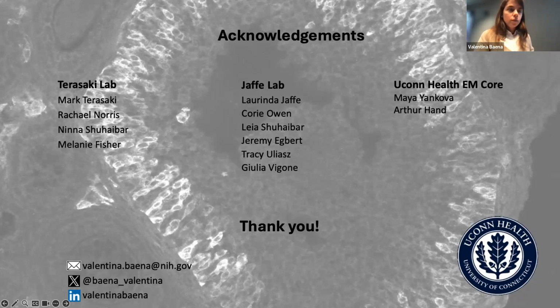Nice talk, thank you so much. Question: I used to do a bit of immunogold on section, and I'm intrigued by pre-embedding immunogold. With pre-embedding, you'll have much higher infiltration, and probably your labeling will be much more enhanced. Can you do dual size immunogold in that instance, or with so much enhancement is this going to be a problem?